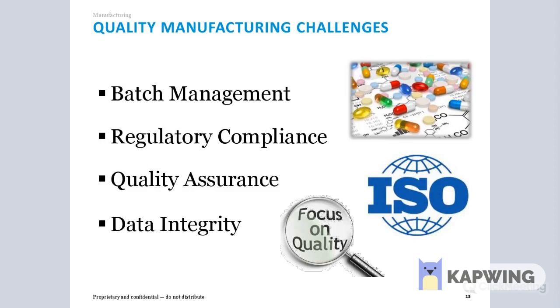Batch management becomes very important. The QC laboratory for manufacturing facilities can be hectic. Changing priorities due to the supply chain can mean analysts have to drop everything and change what they're working on. The availability of equipment and the number of available analysts can also be challenging.